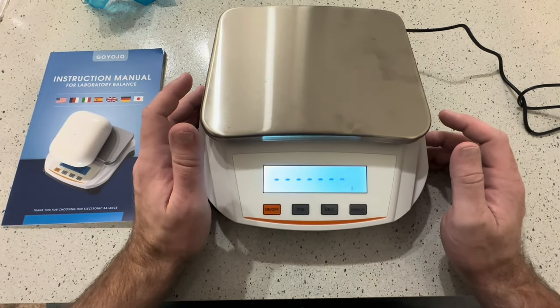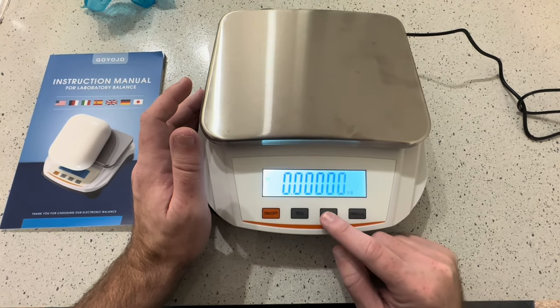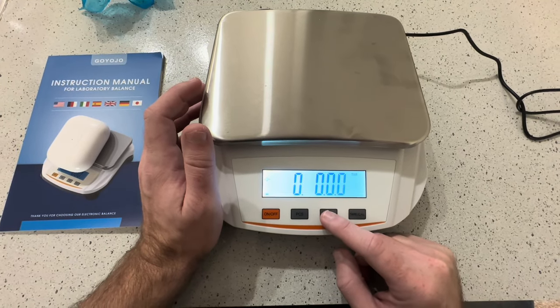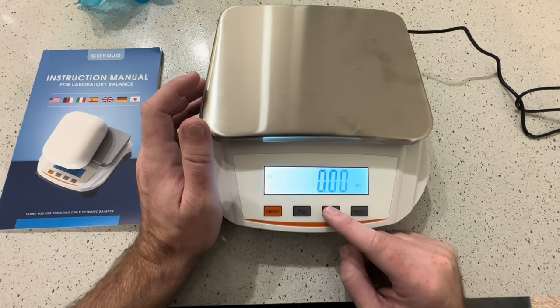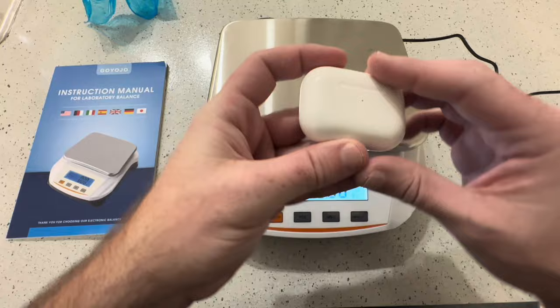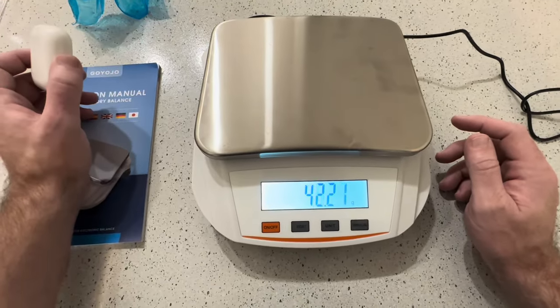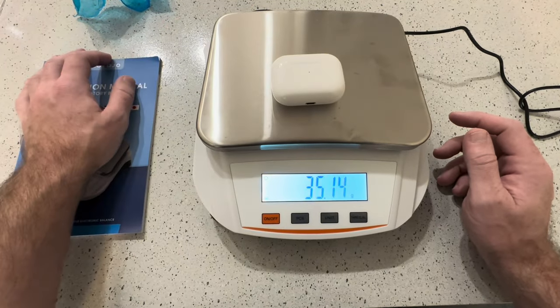We're going to go ahead and turn this on. You can see here that we have lots of different units of measurement — right now we're on grams. You can change to kilograms, ounces, pounds, and back to grams. Just to show you how accurate this is, it can go to a very, very accurate balance. We can take that off, it goes back to zero, and it's super accurate.